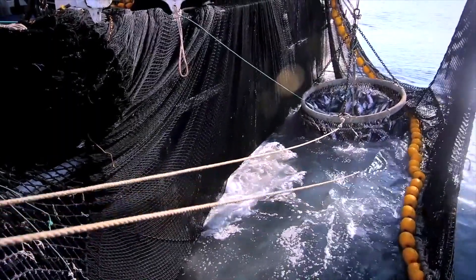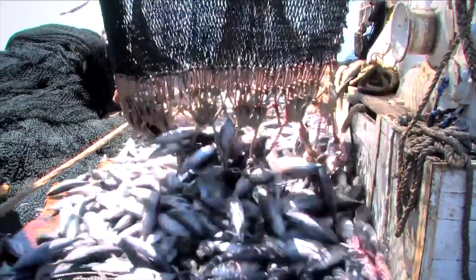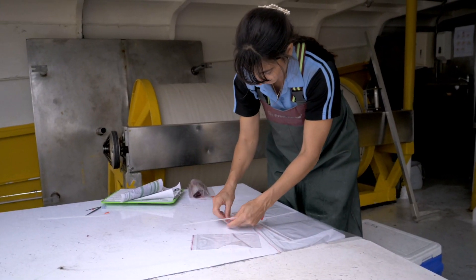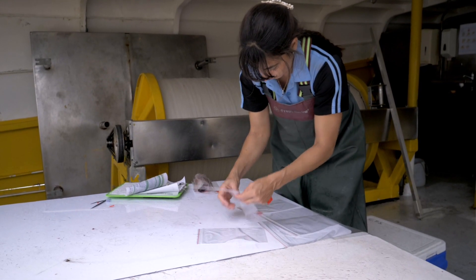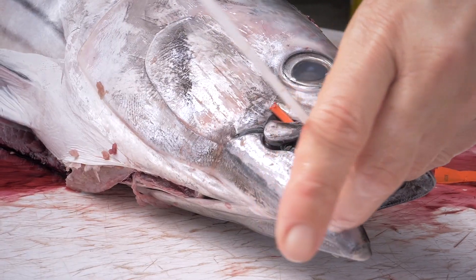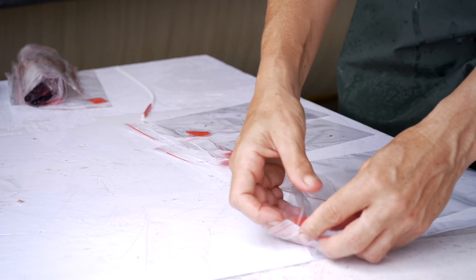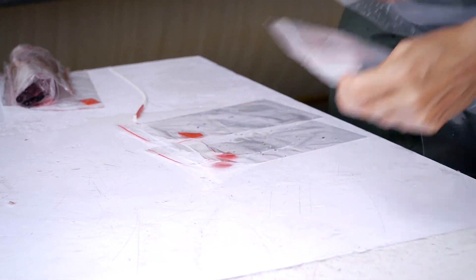On board purse seine vessels, or when you go fishing with your own boat, you can cut the fish belly. Before you collect your samples, prepare your plastic bag with your labels. If you use an SPC cable tie label, remove the label from the mouth of the fish. Once your hand is covered in blood, it will be hard to open the plastic bag.